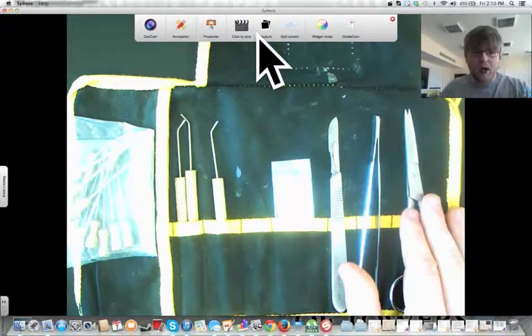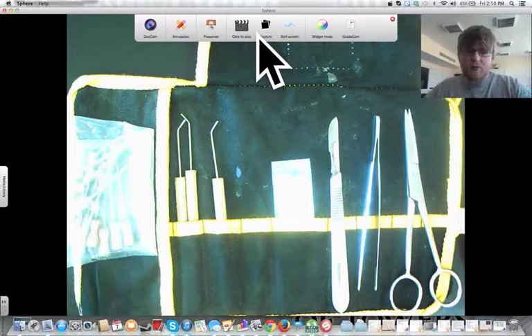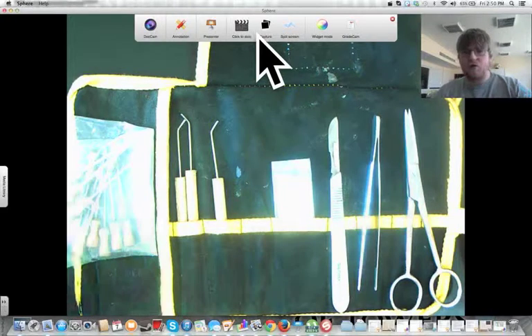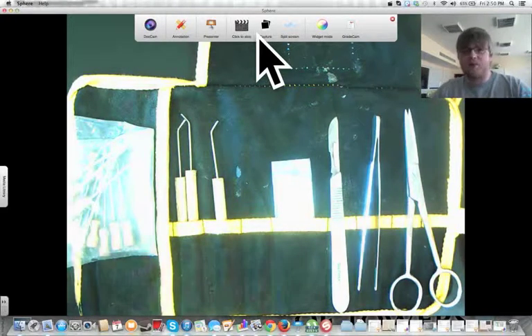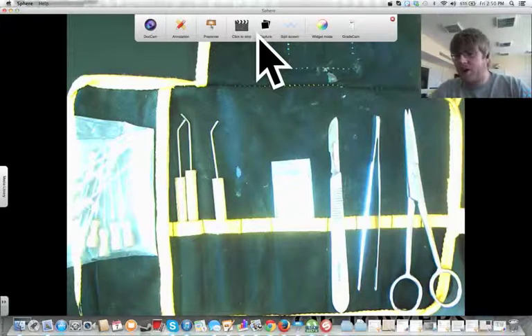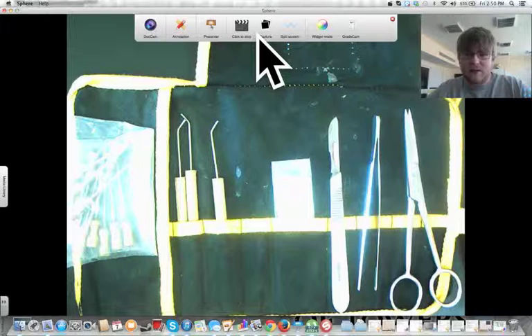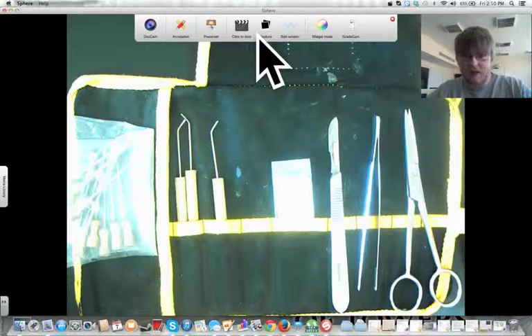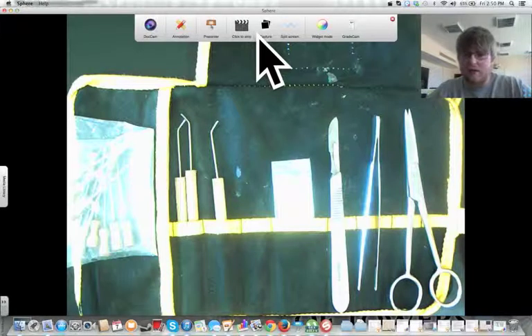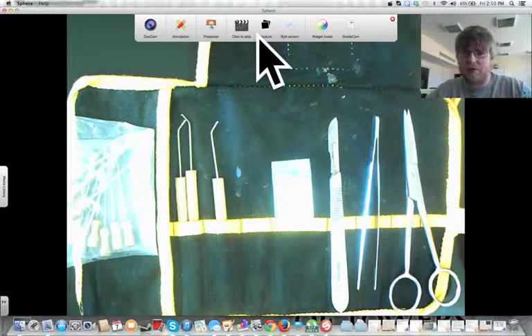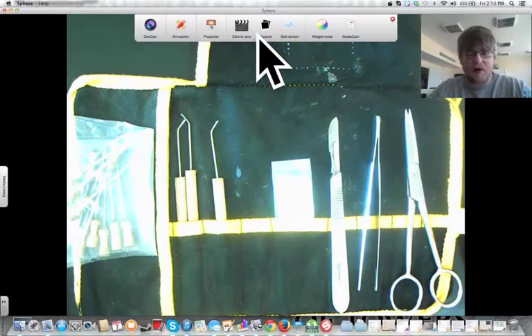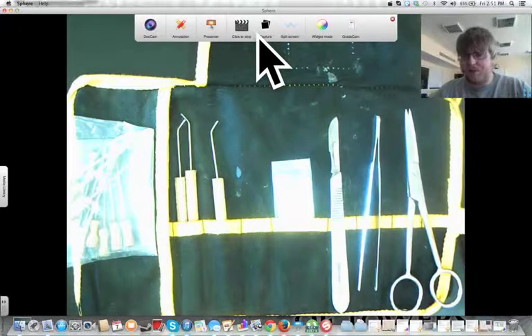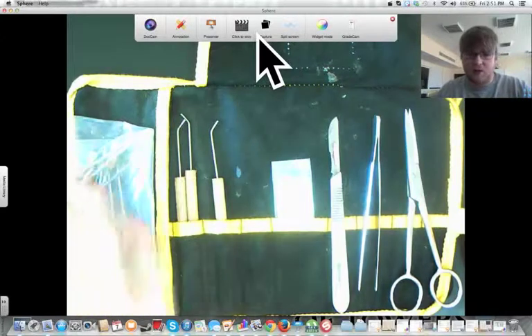Now, dissection probes we're probably not going to use a lot, but dissection probes are used to hold back flaps of skin or flesh that have been cut away. This is a bigger issue in dissections where the specimen has latex in them, which makes the skin and muscle tissue rigid. Since I buy most of our dissections in Abu Dhabi fresh from the fishmonger or from the butchers, you probably won't have to use them. But if you do need to pin something down, you can use these pins.